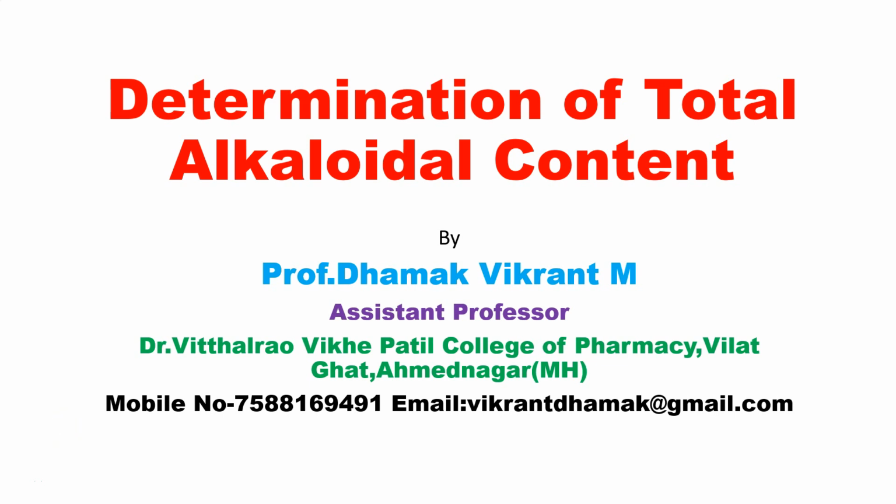In this session we will see the determination of total alkaloidal content, and I will explain the procedure by the calibration curve method, by which you can determine the total concentration of an alkaloid content in any given plant material.